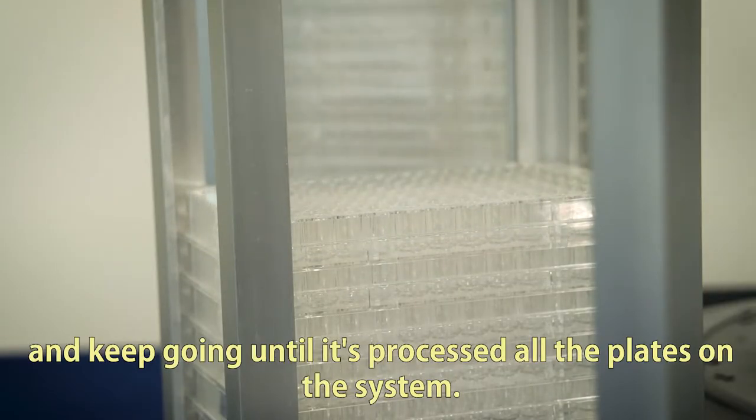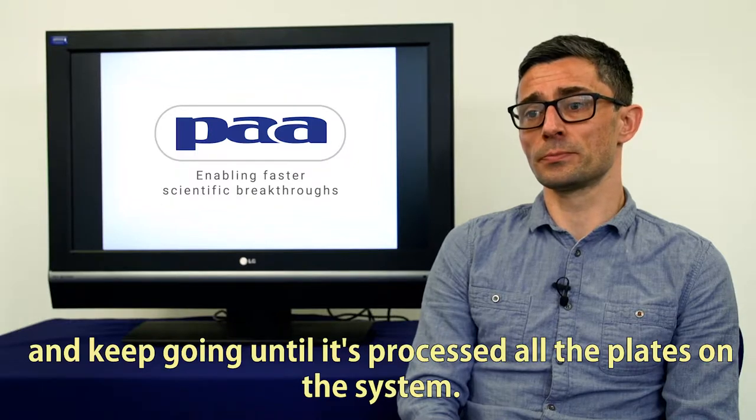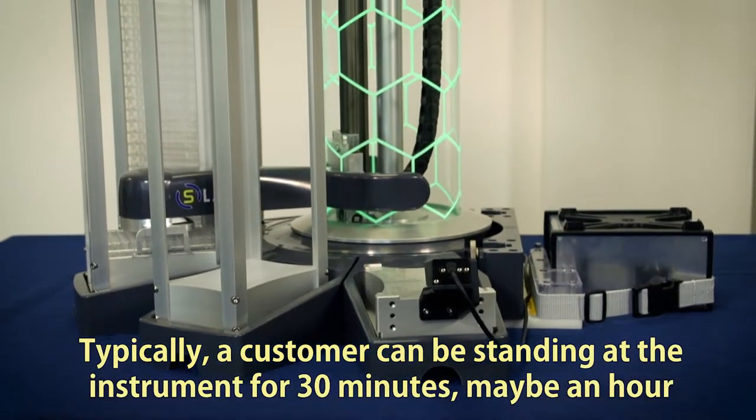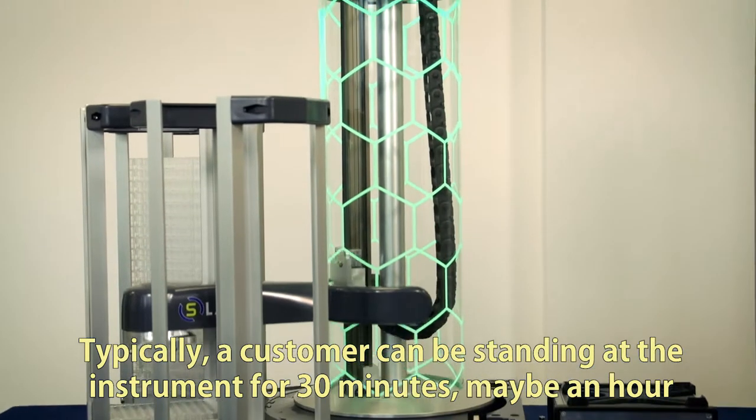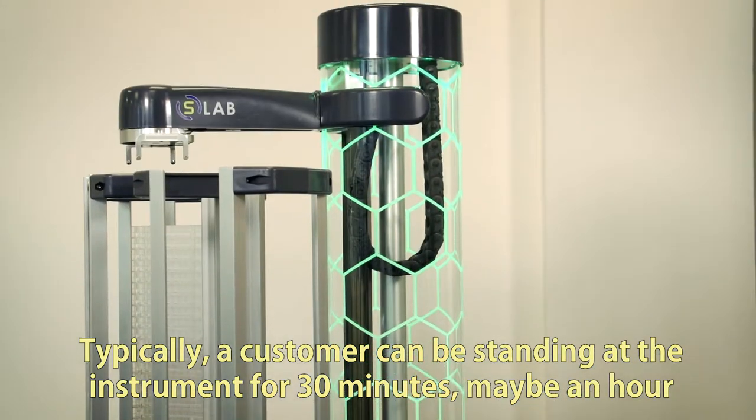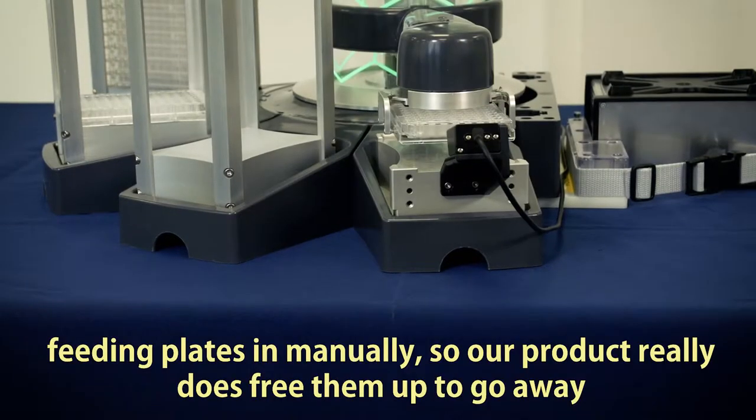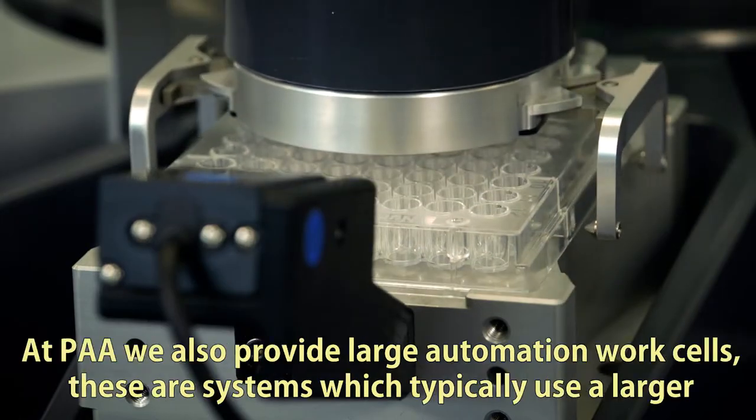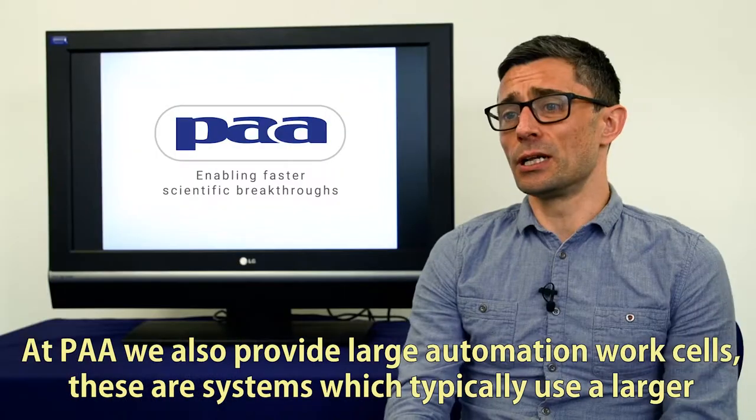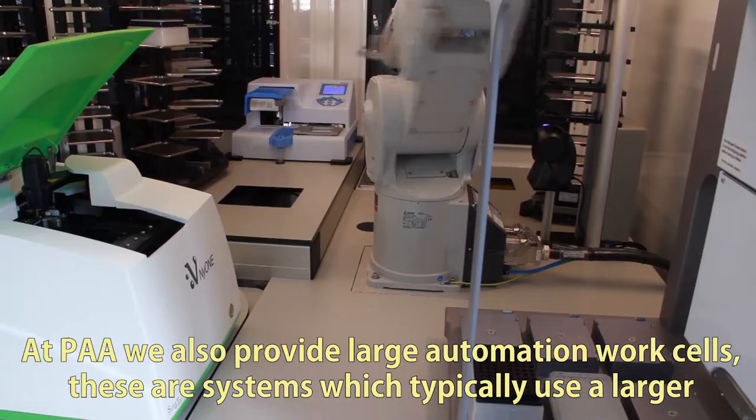The robot will simply then process the next microplate and keep going until it's processed all the plates on the system. Typically, a customer can be standing at the instrument for 30 minutes maybe to an hour feeding plates in manually, so our product really does free them up to go away and do much more important tasks.